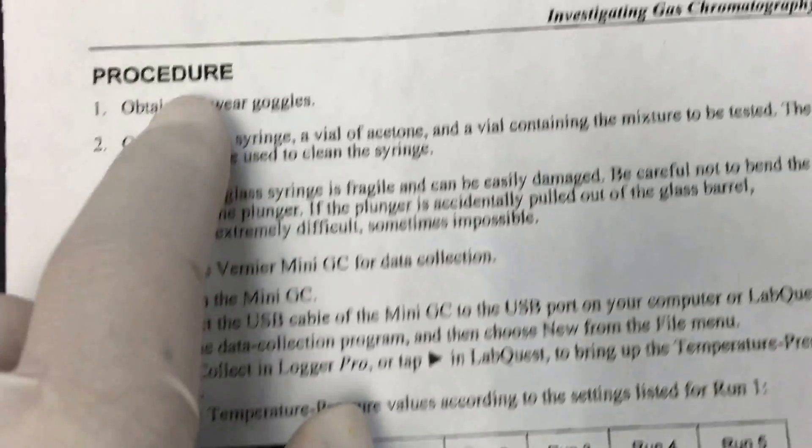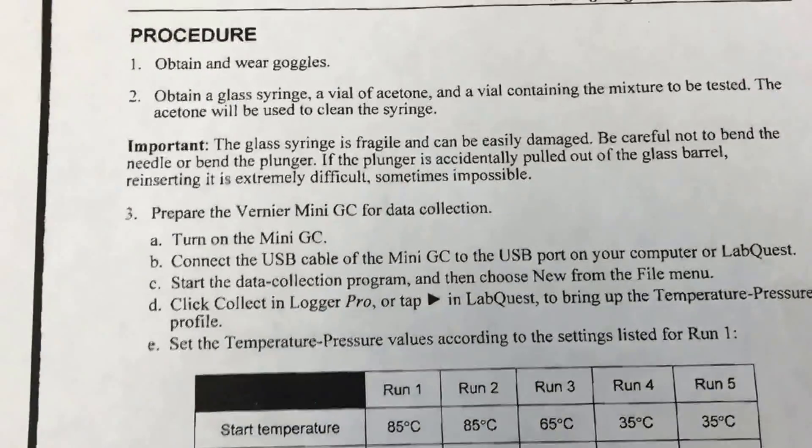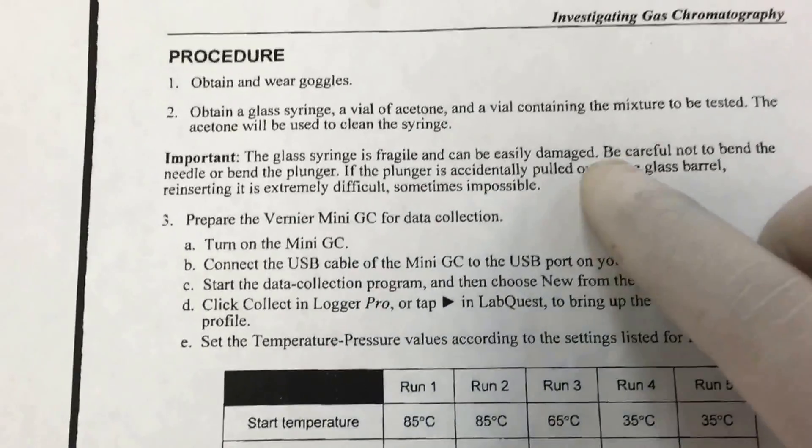The first step: you're working in the lab, so you need to wear goggles. You'll also need to obtain a syringe and a vial of acetone to rinse, according to the procedure.